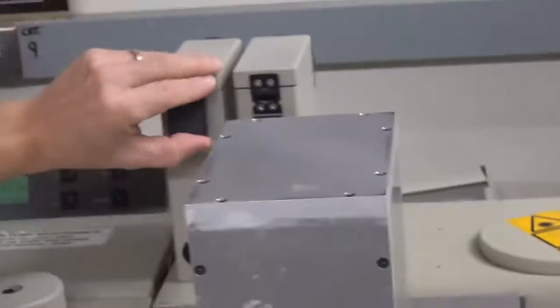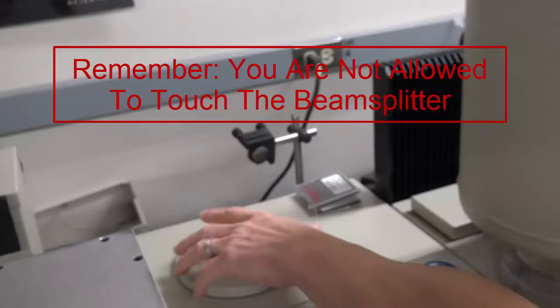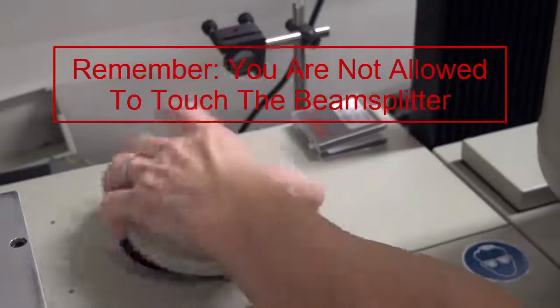The second option is to vent the system and check the beam splitter under the round lid. You vent the system by pushing the down arrow until vent optics is selected and then push enter. Remember, you are never allowed to touch the beam splitter, so make sure you are only looking under the round lid and not touching anything.